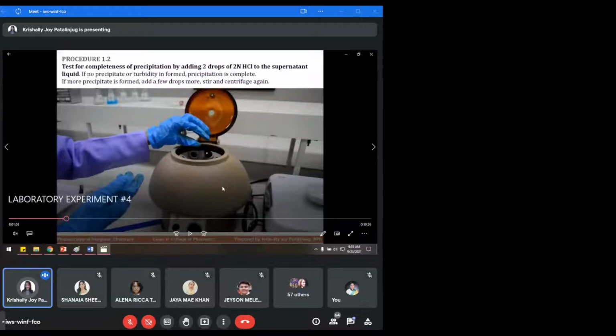Okay, yung equipment na yan, that is centrifuge. Ayan, centrifuge. Centrifuge, that is a laboratory device that is used to separate fluids, that is used to separate liquid from solid. Okay? And yung concept na pinaggagamitan ni centrifuge to separate solid from liquid is gravity.